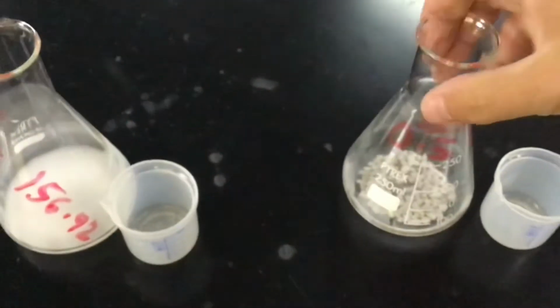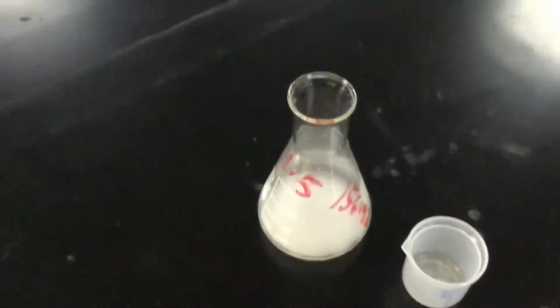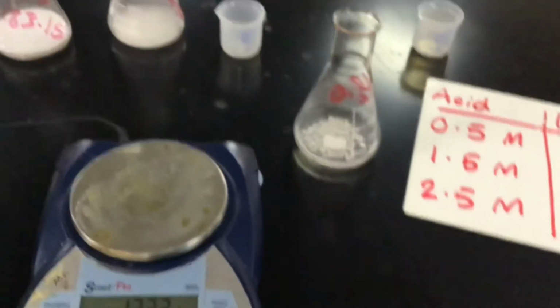You can see that 0.5 now has finished its reaction. 1.5 is finishing its reaction. 2.5 is on its way, working fast. So we can go back to our 0.5 molar now, and we can re-weigh it.